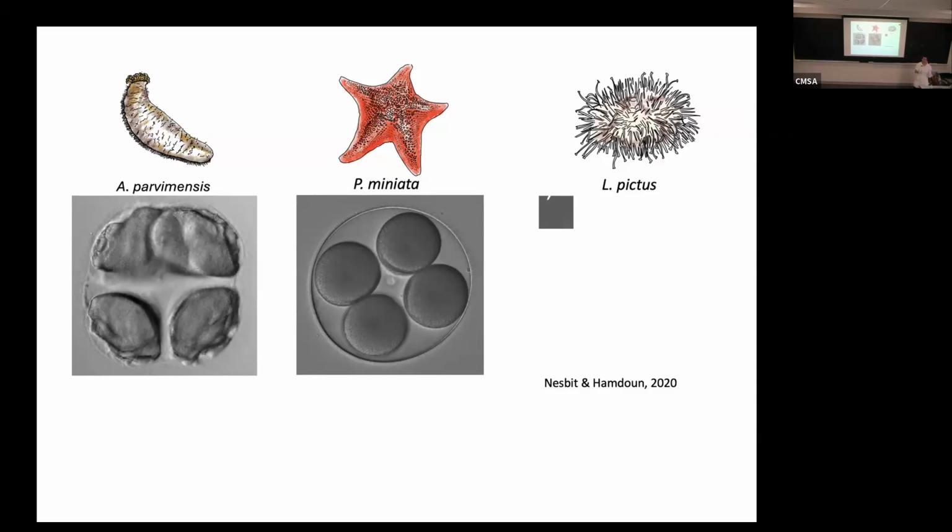We don't have genetic lines like other model systems, but we can inject all kinds of things in these cells, and we can inject them in one of the 4 cells. So you can do the kinds of things that one can do with choanoflagellates, for example, to understand the different kinds of colony shapes. I think we can do more, because choanoflagellates cannot be injected, but they have genetic tools. So we can do some more spatially controlled things. We can overexpress mRNA, express dominant negative or constitutively active forms of proteins, and do CRISPR knockouts. You can do all of those things, as people try to transfer a plasmid from one species to another to see what weird stuff happens.